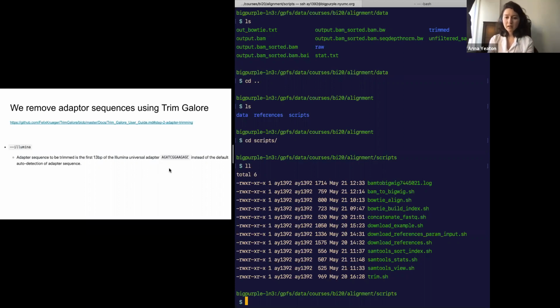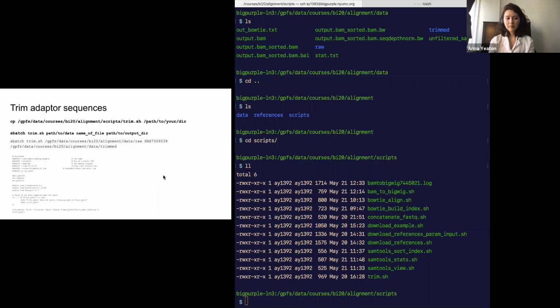Francesco asks, yeah, they're the same. They're from the same cell. Like they are, yeah, they're from the same experiment.